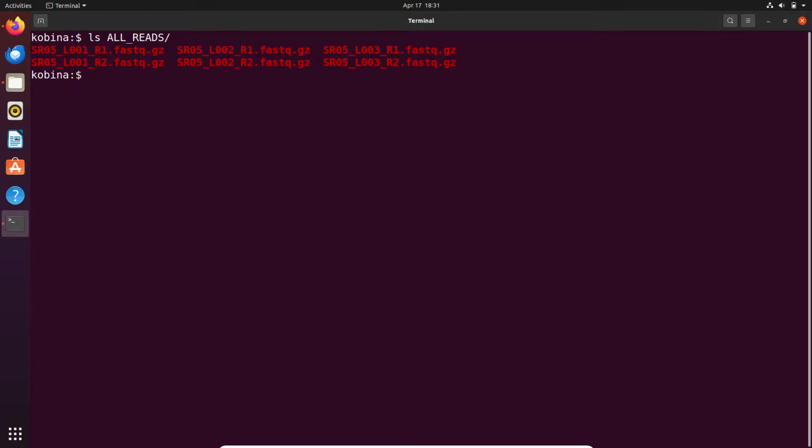Hi, welcome to another bioinformatics tutorial session. In this video, I am going to show you how to merge FastQ files.